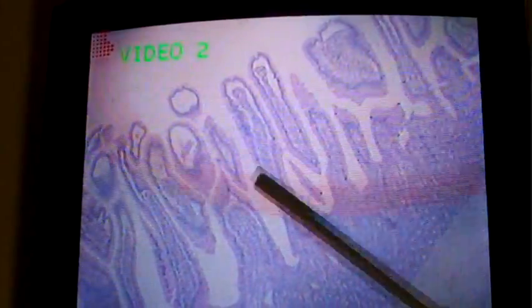Those are villi. What distinguishes this from rugae is that these rise from one spot and then fall back down and connect, rise and fall again, whereas rugae are more wrinkled, and you'll sometimes see multiple foldings on each wrinkle. These, you pretty much get the single finger that comes up and falls back down. So these are going to be villi.